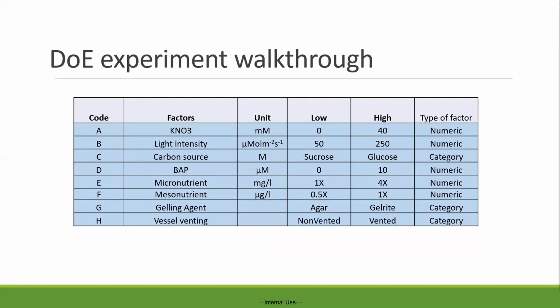The range for each of the factors needs to be chosen as wisely as we can, but reasonable. High and low depend on the system. Use whatever historical data or literature or anything that can give an estimate of the range. We don't want it too narrow so that we might miss the optimal setting, or too big, so we might miss the result.